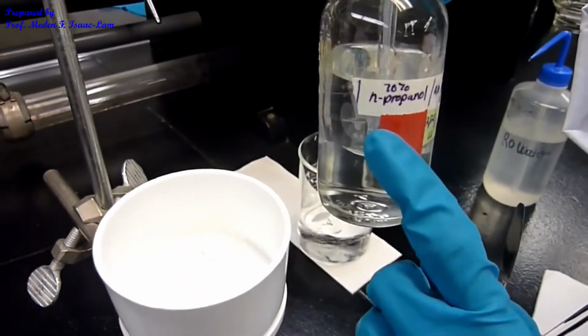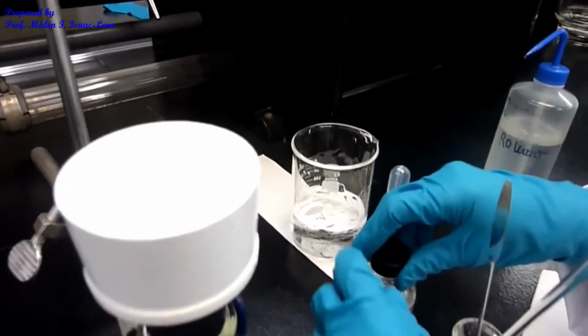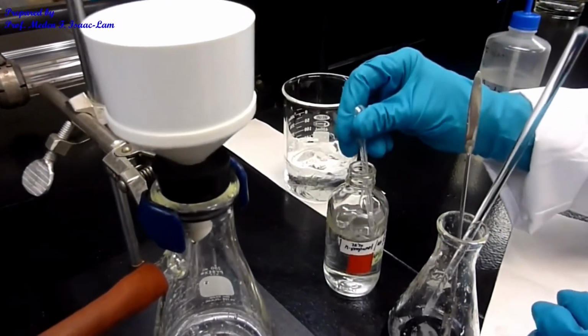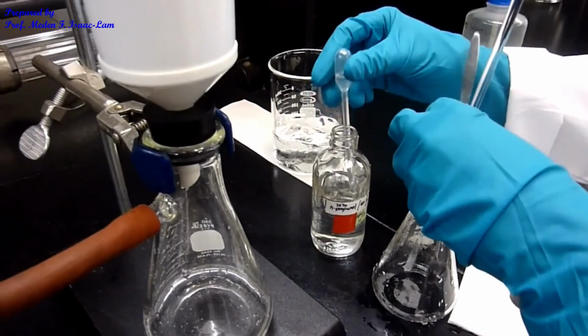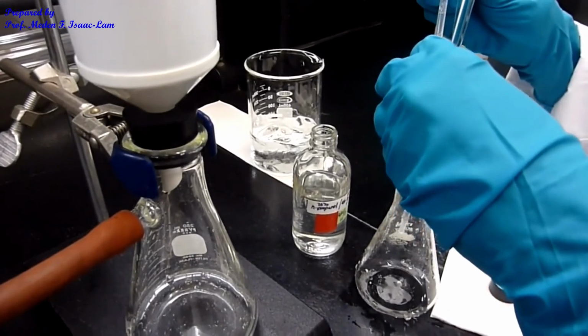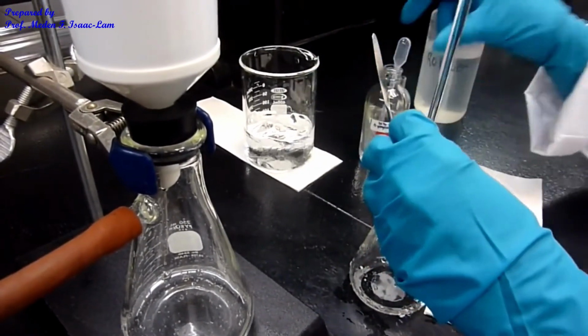So about a ml first, to rinse out the precipitate, but I will do it here first and see if I can take that out.